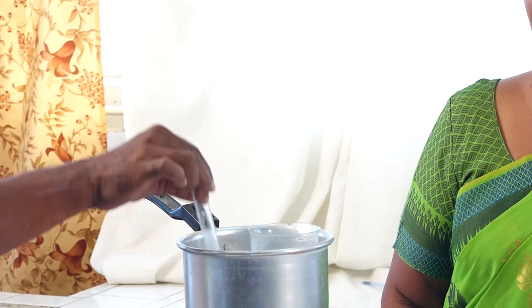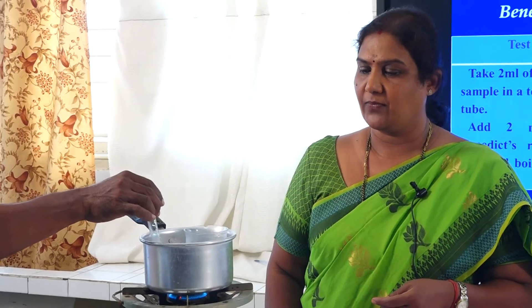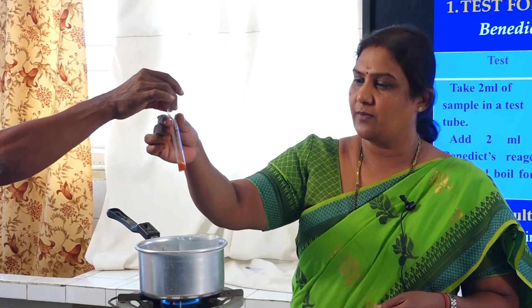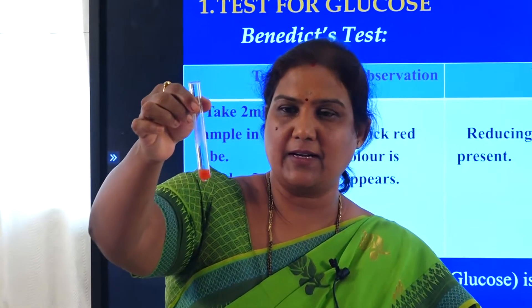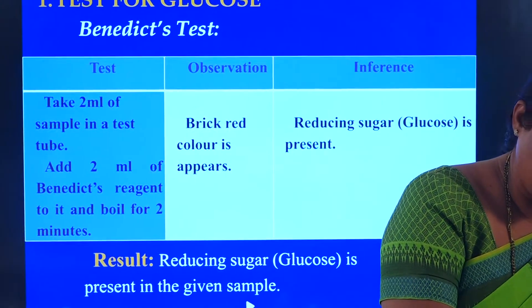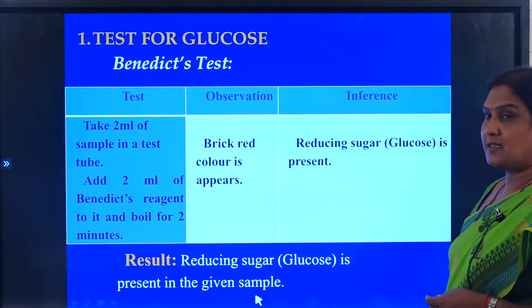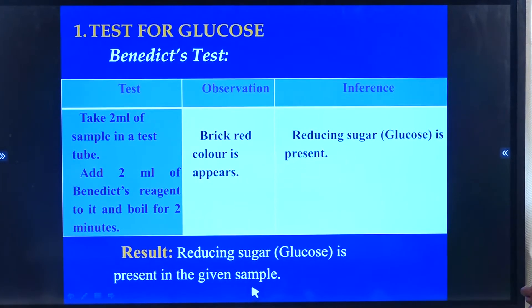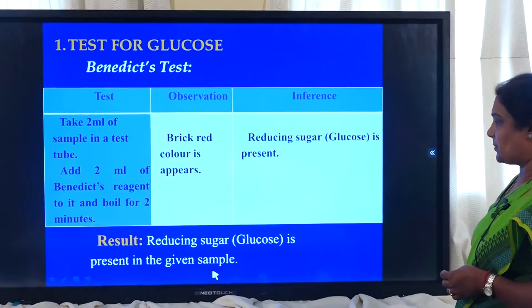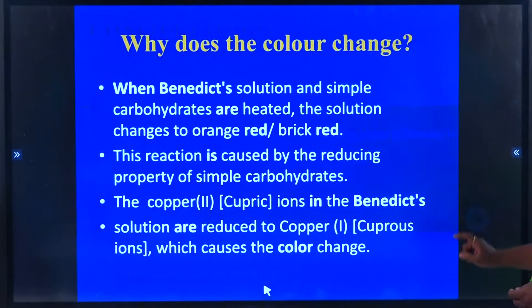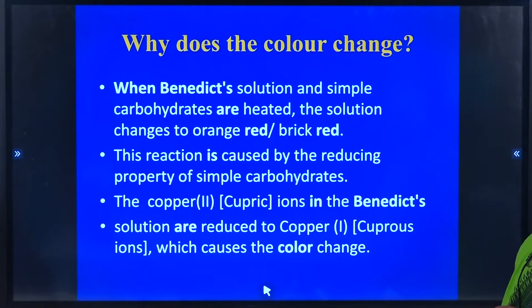Literally 2 to 3 minutes you need to heat it in the water bath. Slowly you are seeing the colour change — there was yellowish-greenish and now it is almost brick red. Yes, it is perfectly brick red in colour. In the observation we are writing: brick red colour appears. In the inference: reducing sugar, that is glucose which is a monosaccharide, is present. Finally, the result: glucose is present in the given sample.